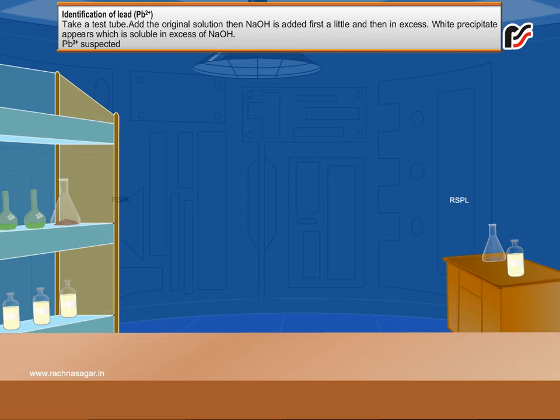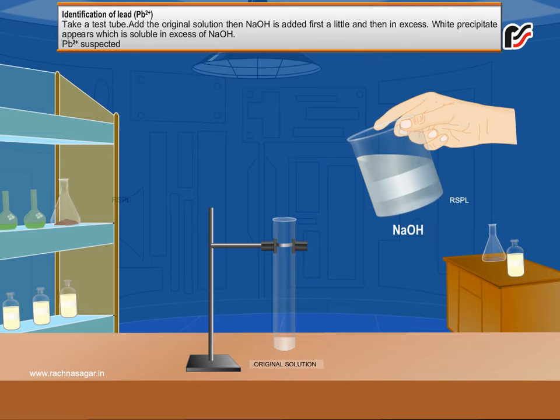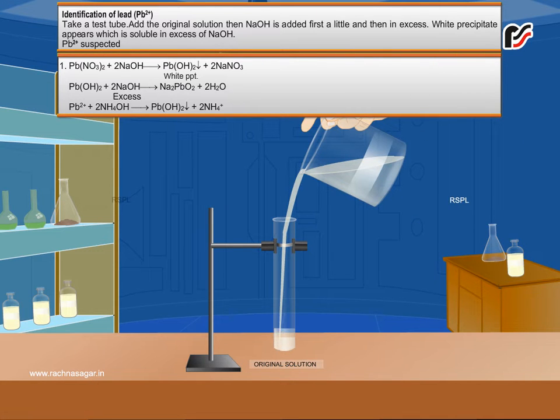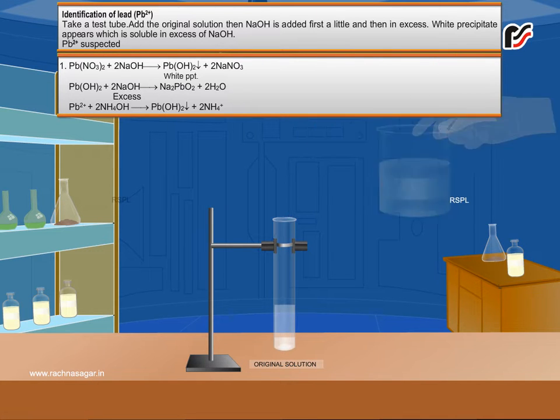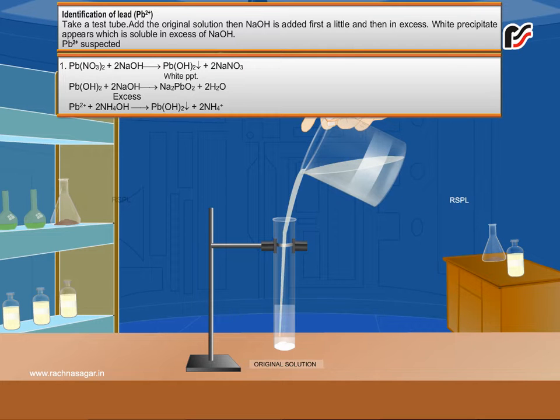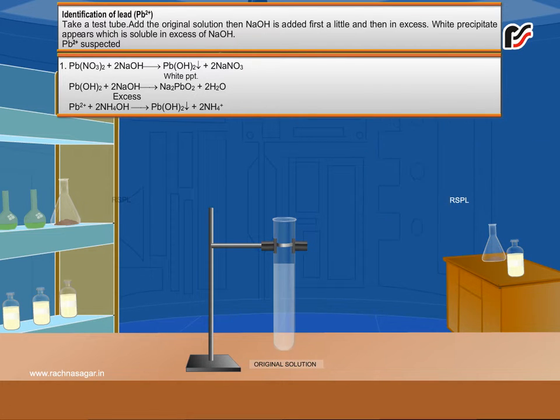Identification of Lead Ion. Take a test tube and add the original solution. NaOH is added first a little and then in excess. A white precipitate appears which is soluble in excess of NaOH. This indicates the presence of Pb²⁺ (Lead Ion).